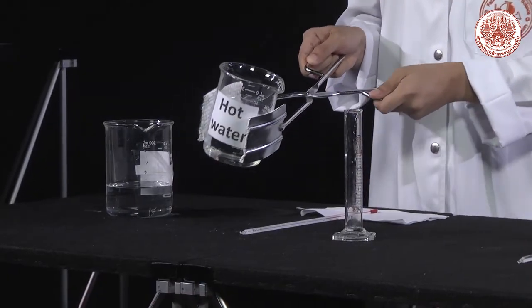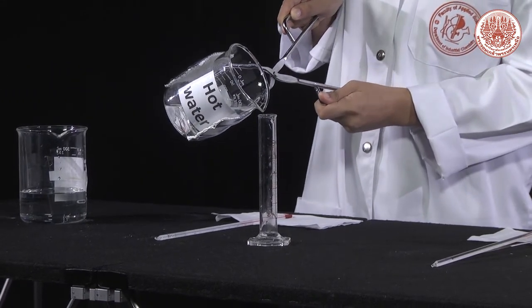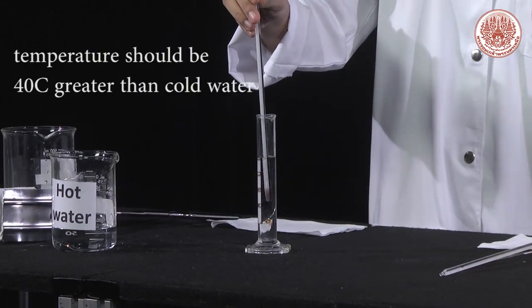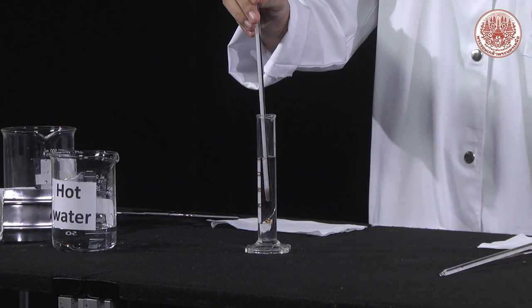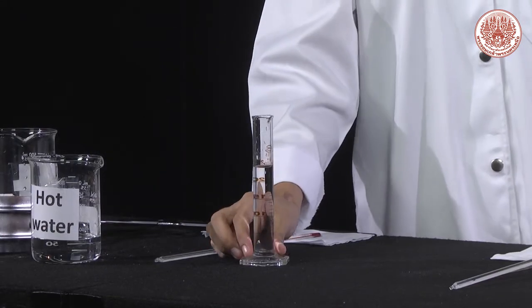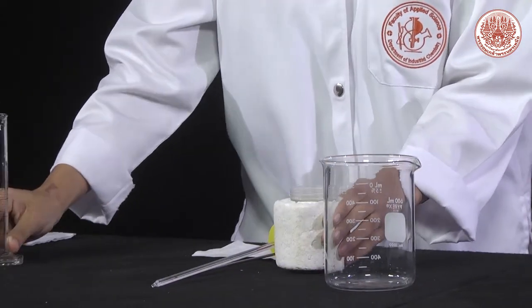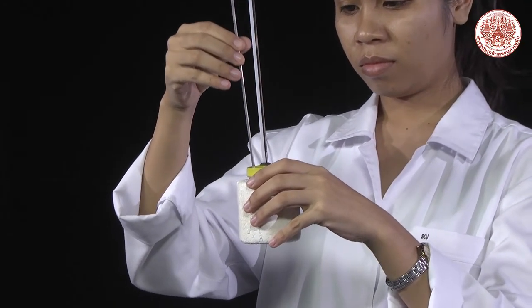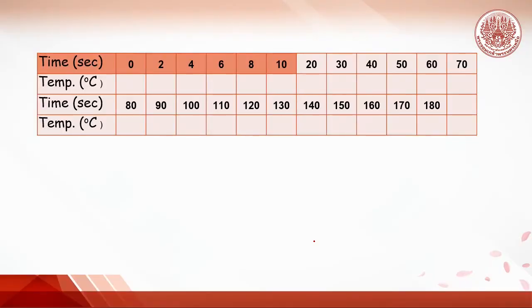Then get 25 ml of hot water using a graduated cylinder. Record the temperature of hot water, which should be 40 Celsius greater than the temperature of cold water. Immediately pour the hot water with care into the cold water in calorimeter. Stir gently and record the temperature every 2 seconds for 10 seconds and every 10 seconds for 3 minutes or until the steady temperature is obtained.